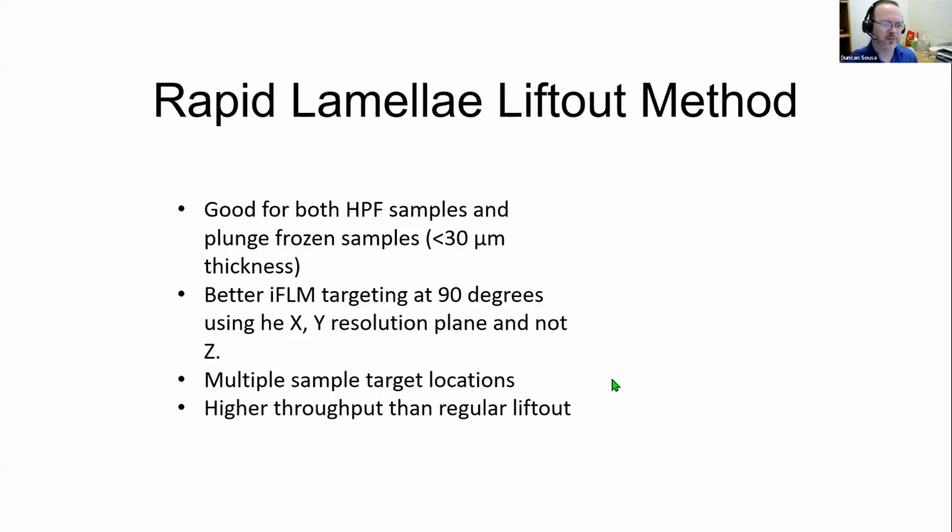You can use multiple sample locations. So you can go around the grid, take it from different cells or material locations or tissue locations, unlike the serial block method. And it's higher throughput than the regular lift-out method.